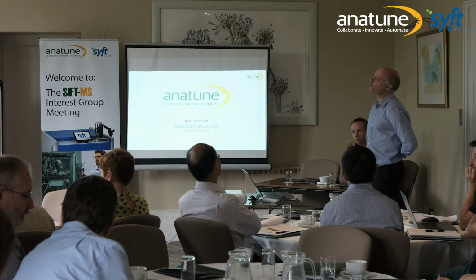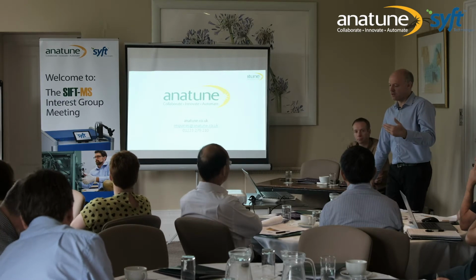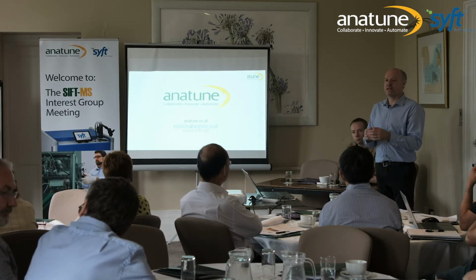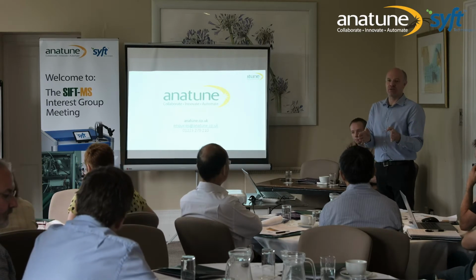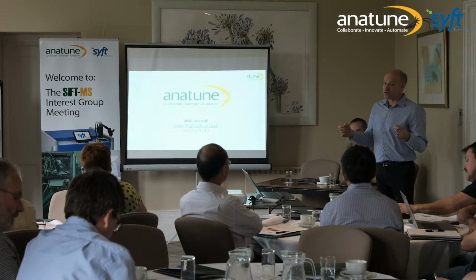Well, unless the method states that, because if you look at ISO methods or many methods, they will give you the required technology to do it, and in many cases it will say "or a validated alternative," and that's the critical part of it. If you're going to use an alternative method to what's stated in the ISO standard, you will have to do some form of validation.